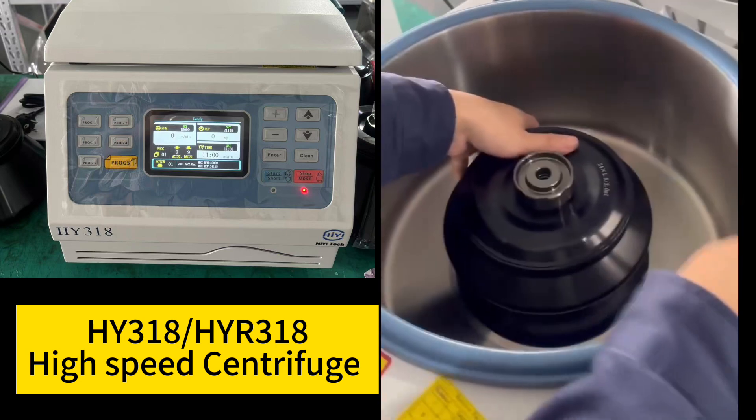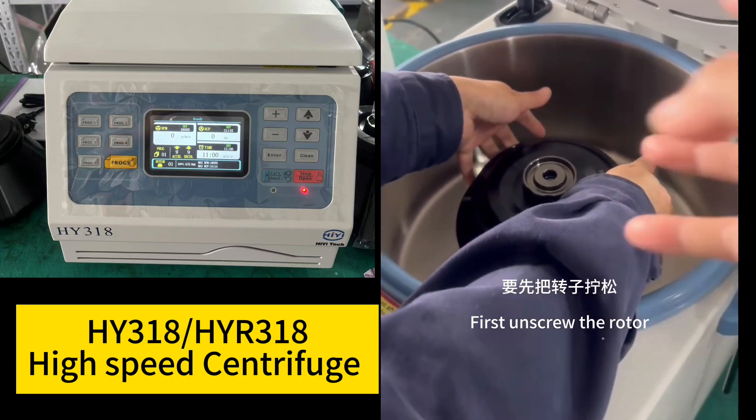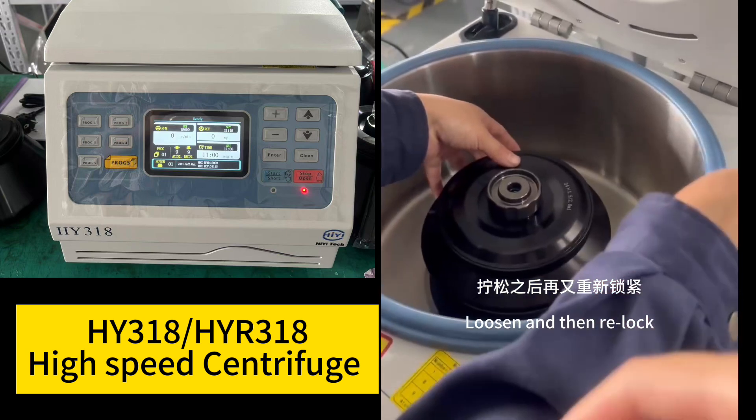When receiving the rotor for the first time, there is also a foam underneath the rotor. First unscrew the rotor, loosen it, and then re-lock.